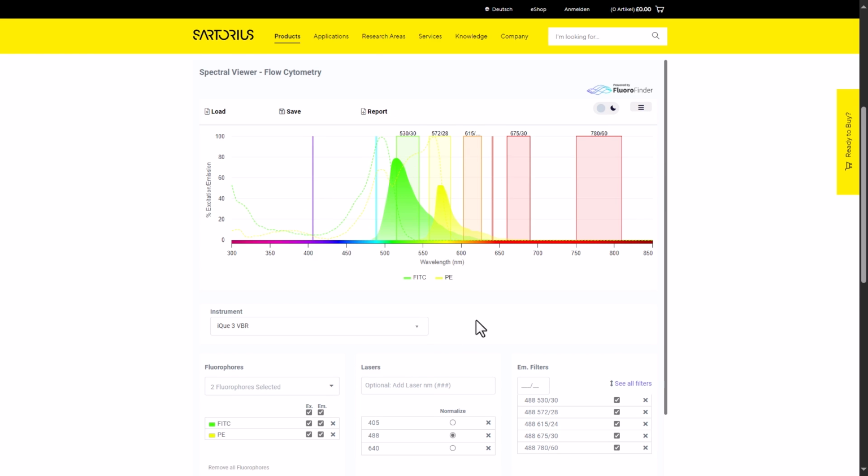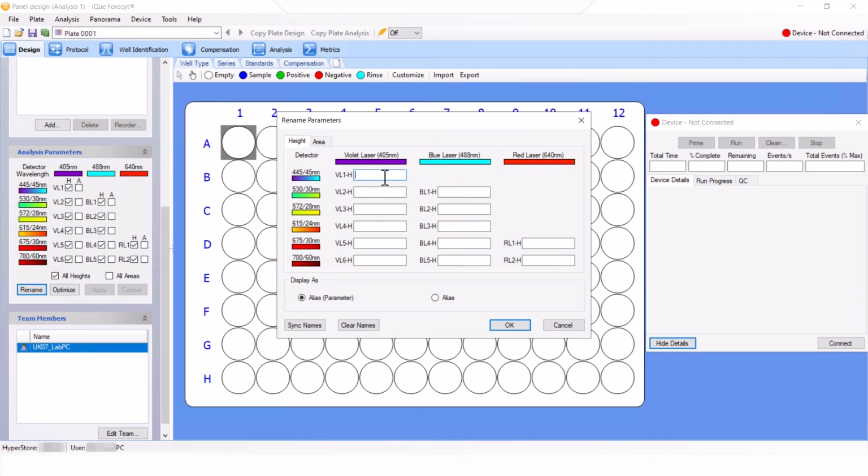If we add in a second fluorophore, for example PE, which fits in the BL2 channel, we can get an idea of what the level of overlap is between the emission spectra of the 2 fluorophores. Ideally, we want to minimise the overlap between the emission spectra of fluorophores. Therefore, if only using a few fluorophores in a panel, it is best to spread them out across the lasers and detection channels to reduce the likelihood of overlap.